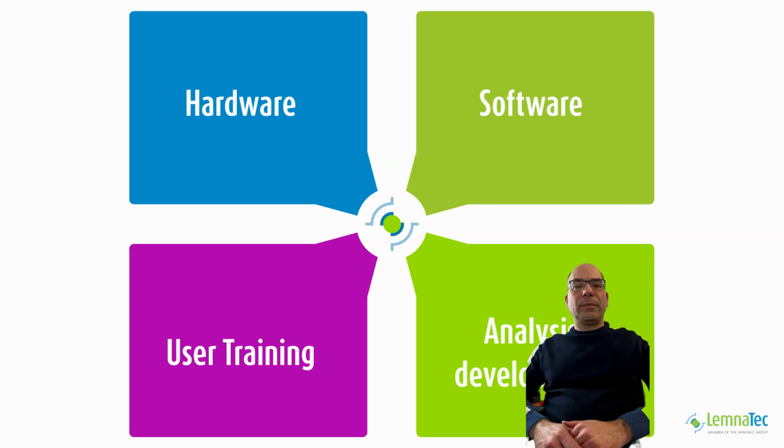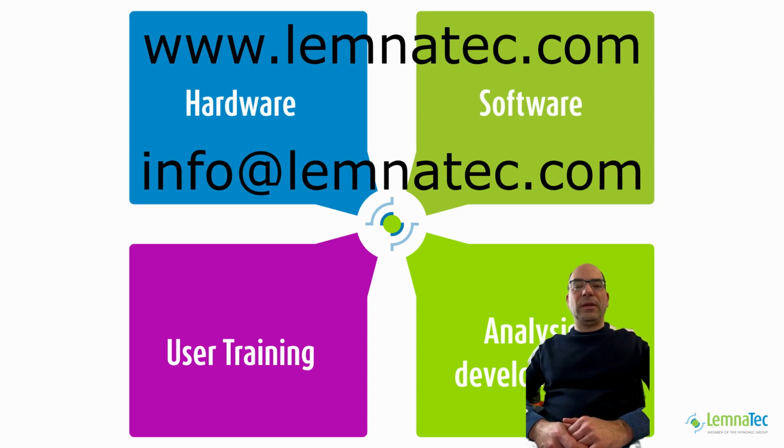Taken together, the whole package is much more than the hardware. It's software, it's training and analysis development, all aiming at enabling you to start phenotyping with your new system.